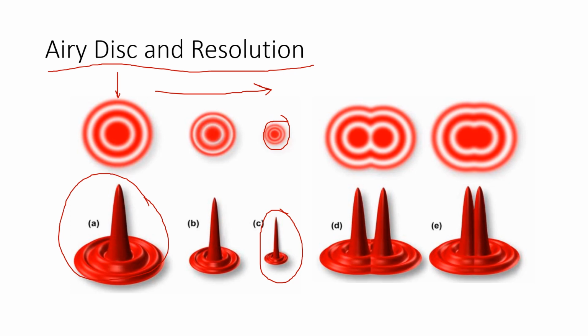Now, when you want to resolve two images, their centers should not overlap. If the centers of the airy disks are overlapping, you will not be able to resolve the image.